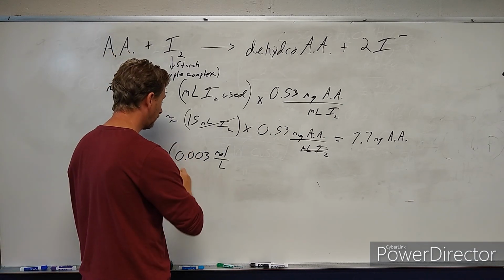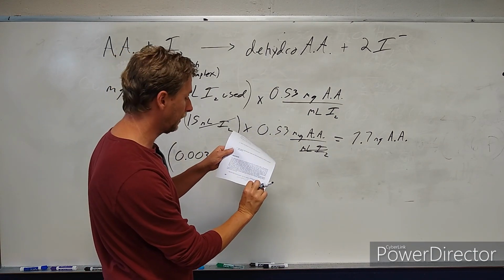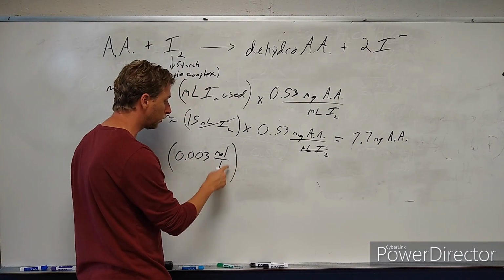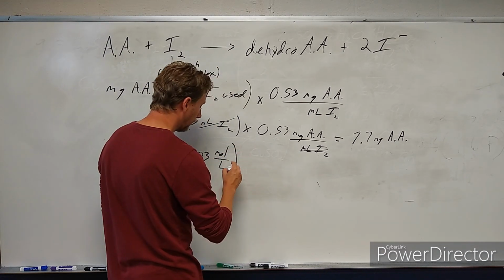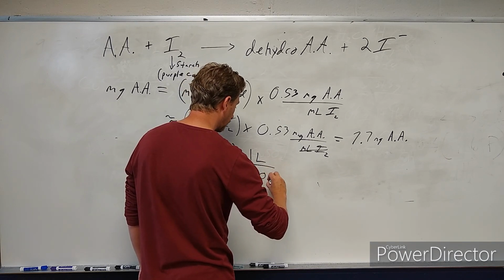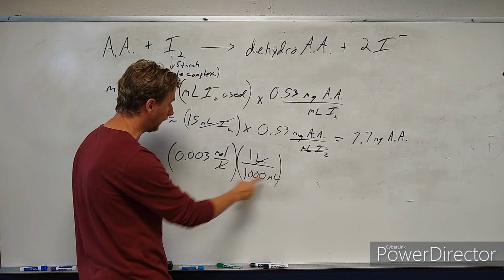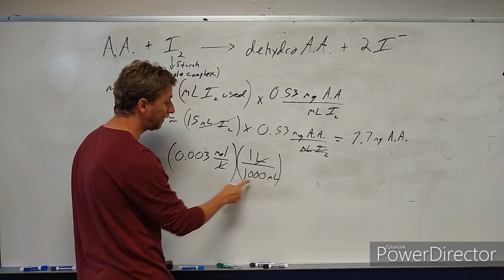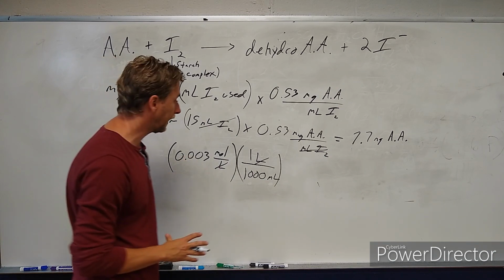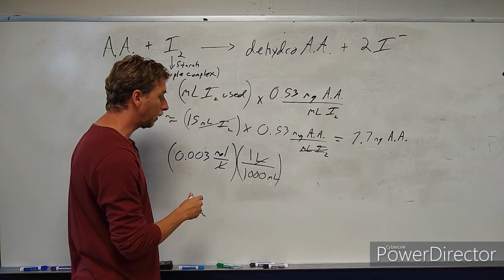convert that concentration. Since we got 15 milliliters here, and the formula on the procedure here is written in terms of milligrams and milliliters, I'm going to go ahead and convert this to moles per milliliter. Well, of course, if you want to get rid of liters, then you can say 1 liter up top per 1,000 milliliters on the bottom. And you see that will cancel out liters and leave you with milliliters. So that would be 0.003 divided by 1,000, which puts you in terms of moles per milliliter. We don't have to punch that in our calculator yet, but that will take care of the units for us. So now we're in terms of milliliters of iodine.